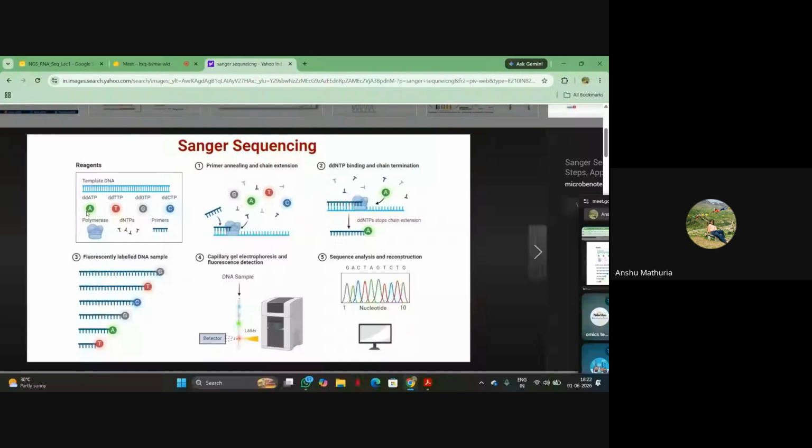Now, when they enhanced the Sanger sequencing, they radio labeled the ddNTPs initially, and then they fluorescently labeled all these A, T, G, C, the dd tags. So whenever these get incorporated, there will be a fluorescent tag attached, and you will get a band that is gray, red, blue, whichever nucleotide is incorporated. When the amplification is happening, if this gets incorporated, the chain will stop there. In another amplification, say ddTTP gets incorporated, it will stop here. In a similar way, you will have multiple small stretches of nucleotides that end with a particular fluorescently labeled ddNTP.